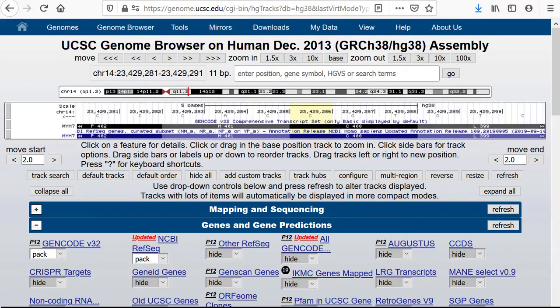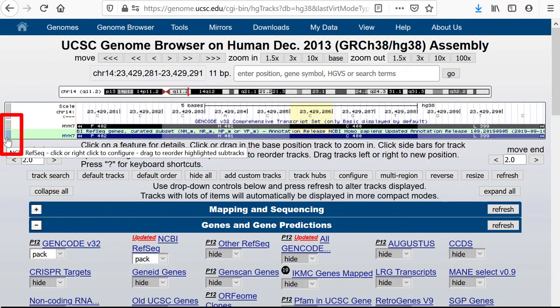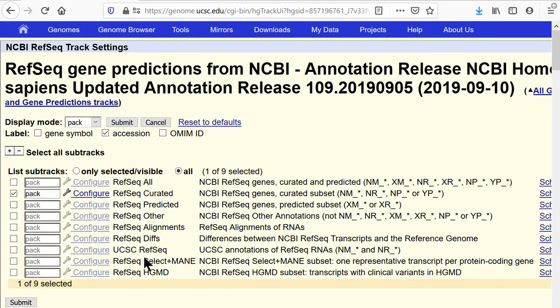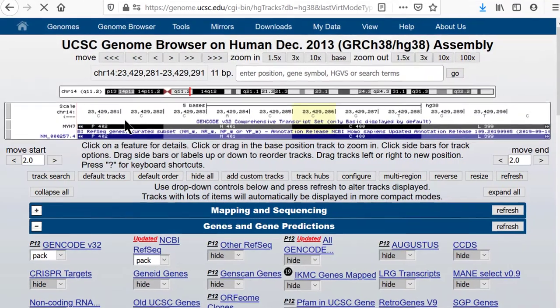Let's click into the configuration button at the left side of the track in the image and turn on the RefSeq accession numbers to confirm that we are truly at NM_000257. You see on the configuration page that there are other RefSeq tracks available in this composite track, but they are not turned on by default — only the RefSeq curated track is turned on. Returning to the browser image, we see the expected NM number.